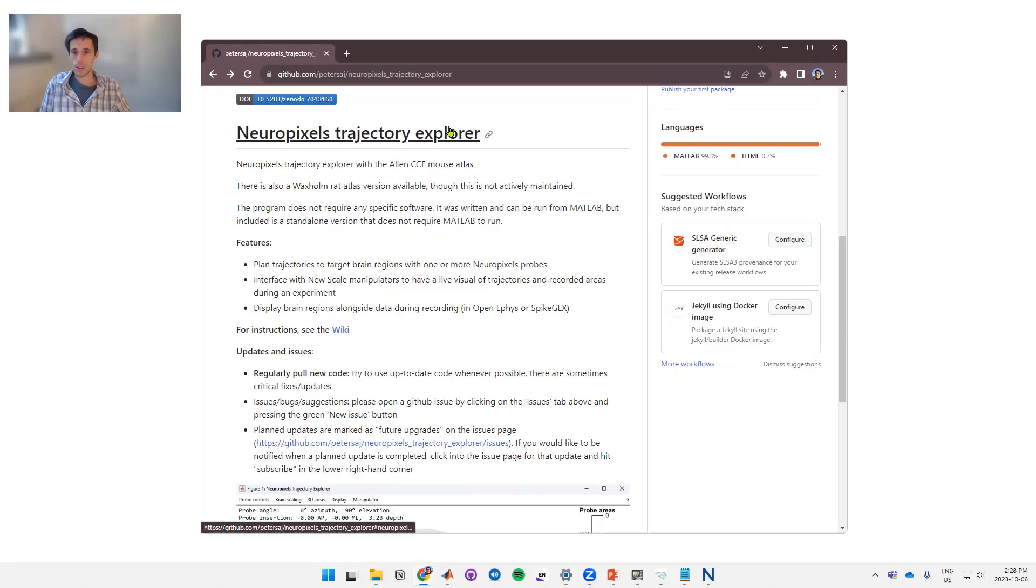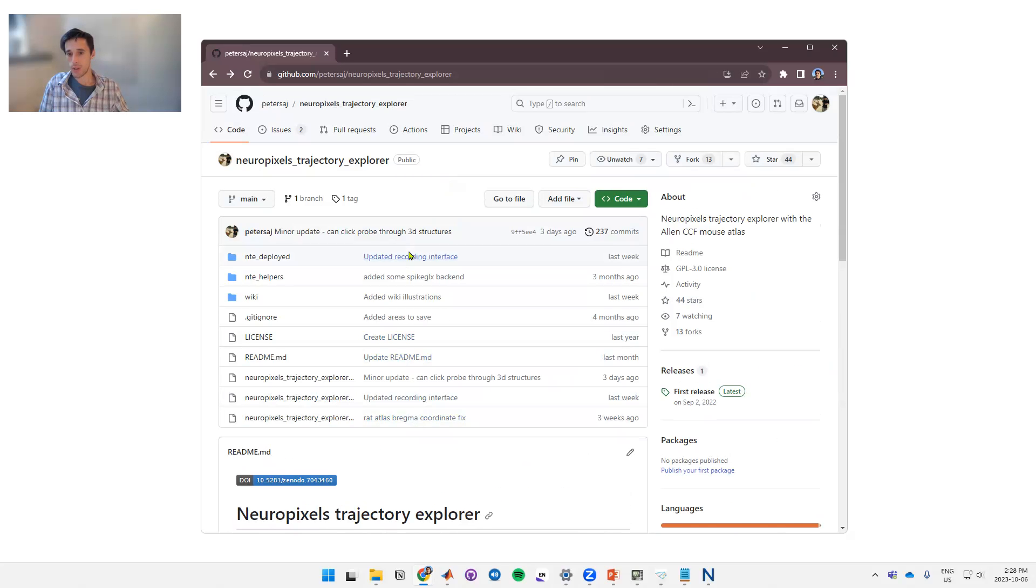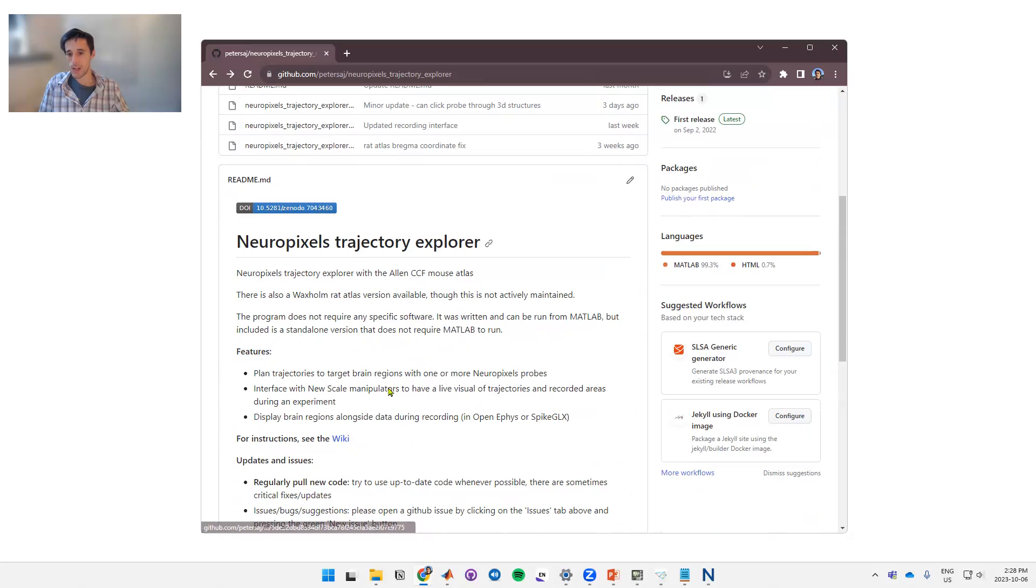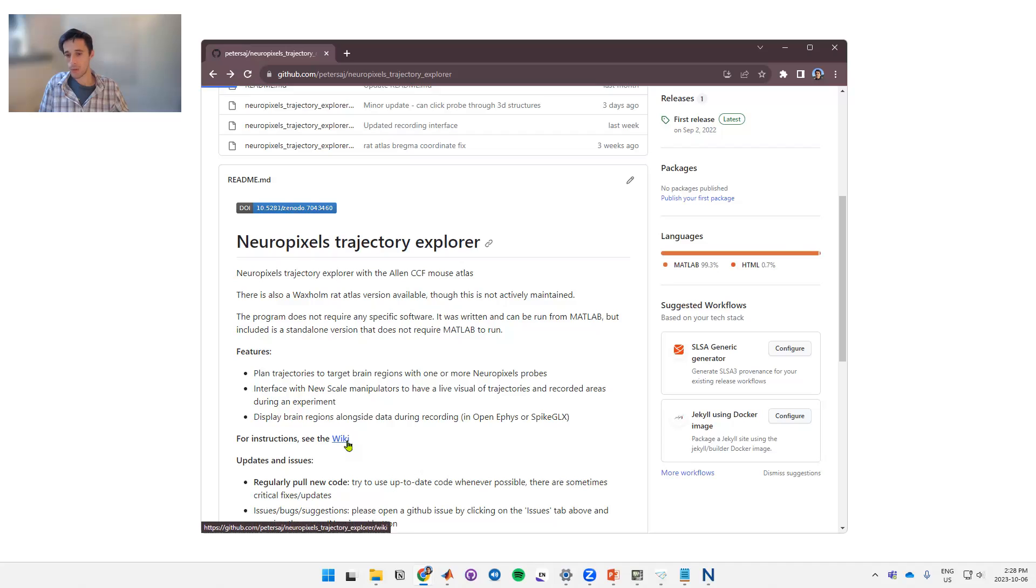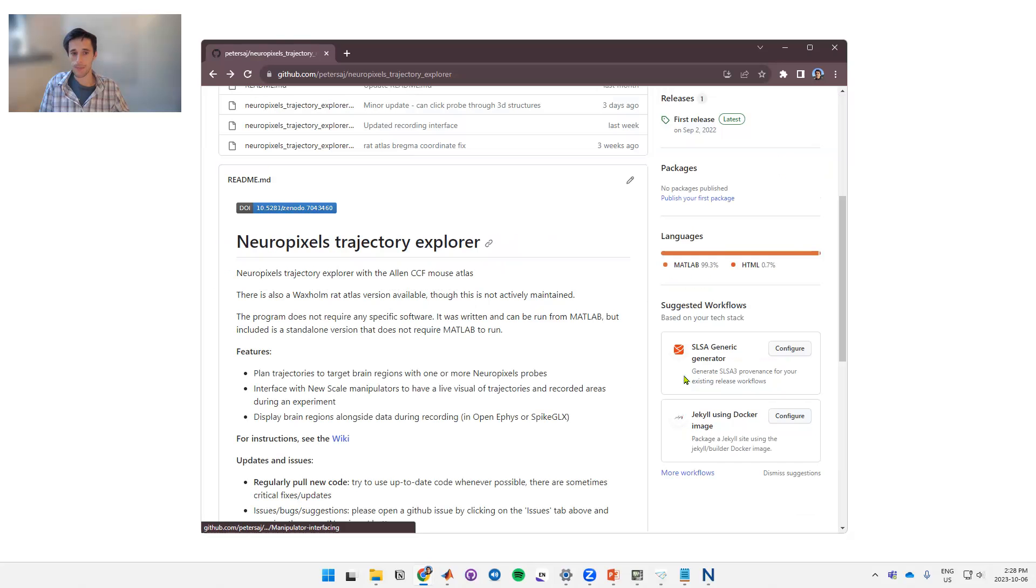In order to get the software, you can do so through the GitHub page. There will be a link provided. On this GitHub page you can download all the software you need. There's also a wiki that has written instructions on how to use it.